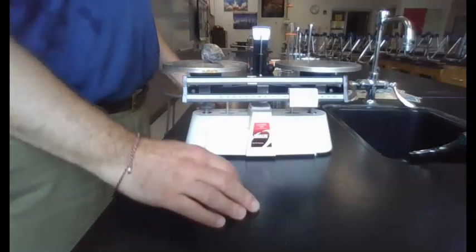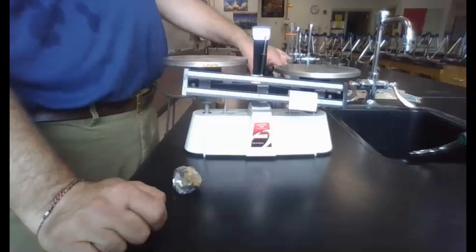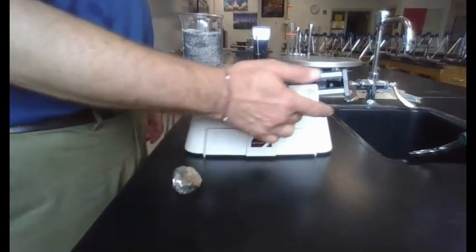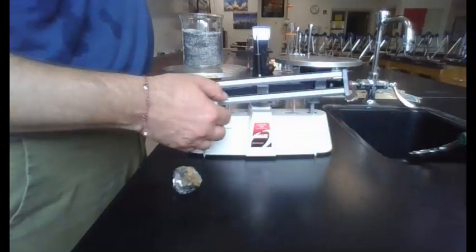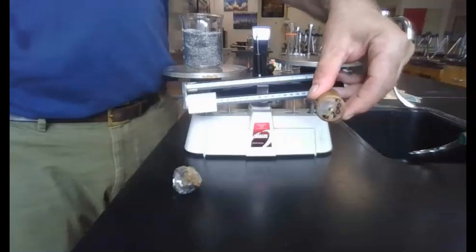grams. Now, what happens if we have something that weighs more than 200 grams? What do we do? Like, for instance, this. No, nothing we do is going to be able to balance that. So what we need to do is have a separate weight. This weight is 200 grams.